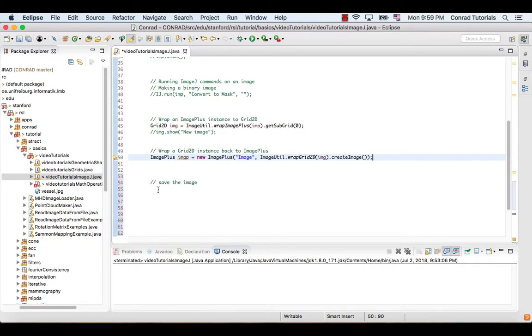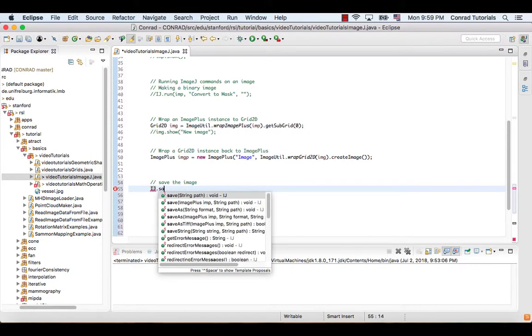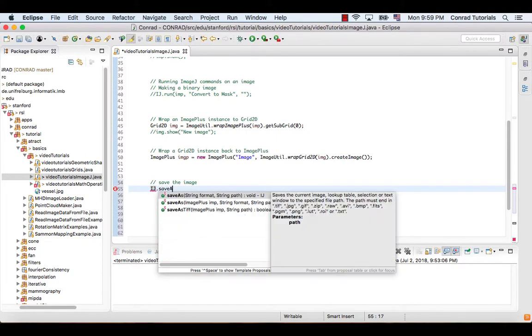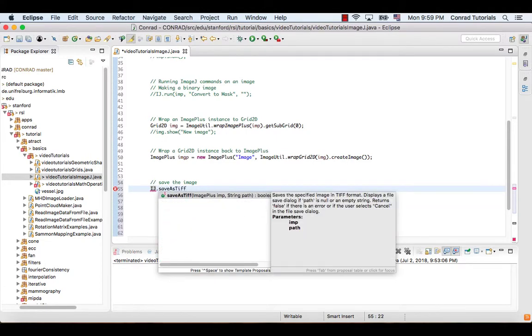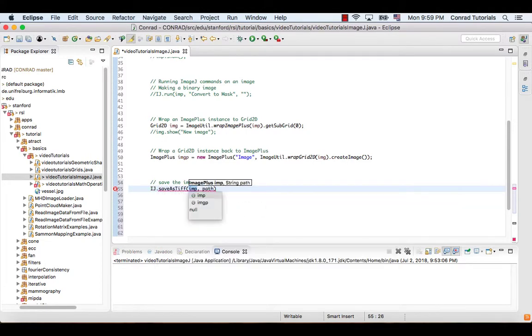Finally, we can save the image that is stored in an ImagePlus instance in any supported format, for example TIFF.